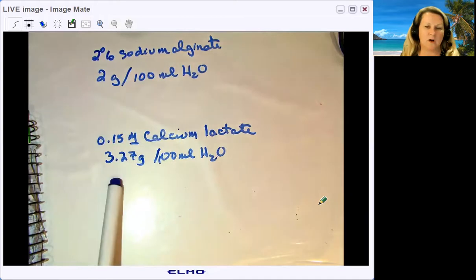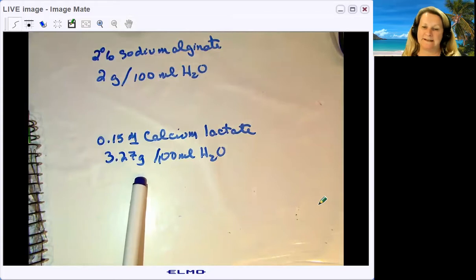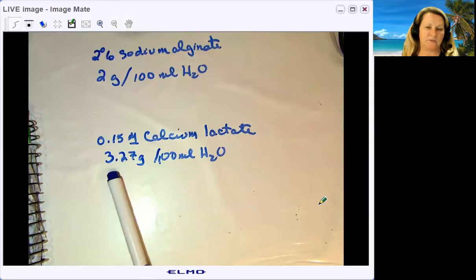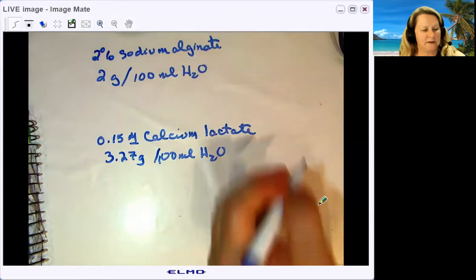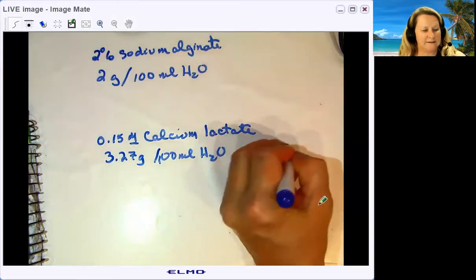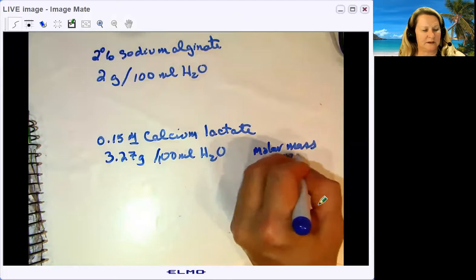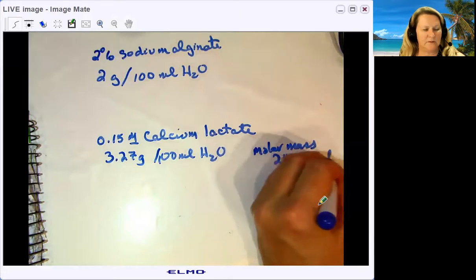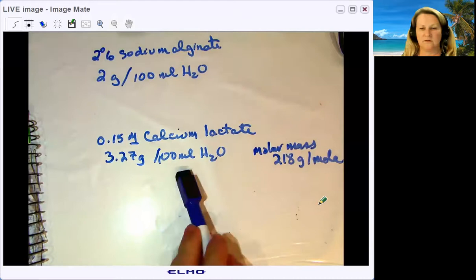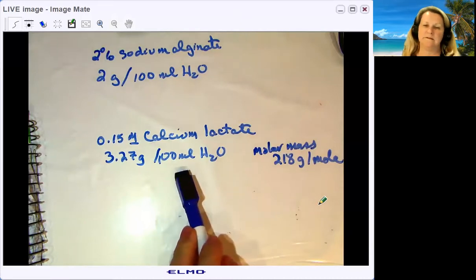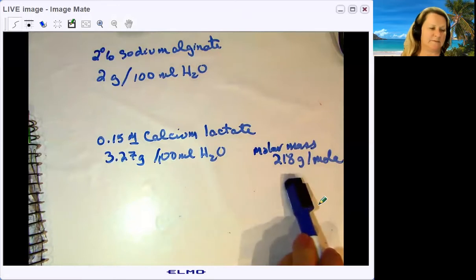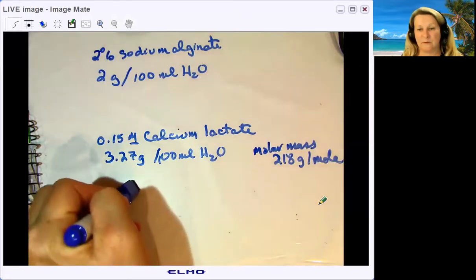You also need a 0.15 molar calcium lactate solution. I'm making 100 mL today, which is 3.27 grams per 100 mL. How did I figure that out? The molar mass of calcium lactate is about 218 grams per mole. If you do the math to make 100 mL (0.1 liters) of a 0.15 molar solution with molar mass 218 grams per mole, it works out to about 3.27 grams.